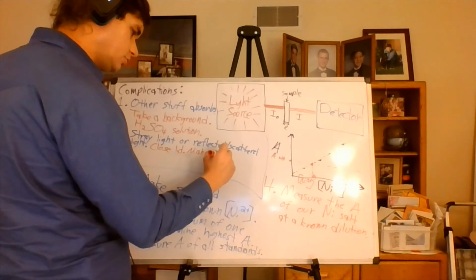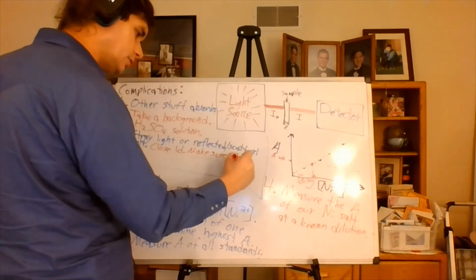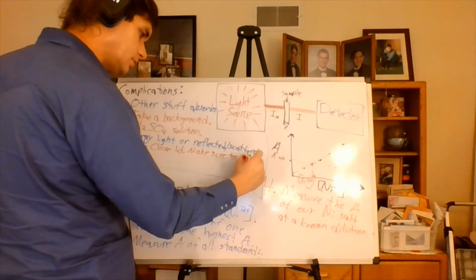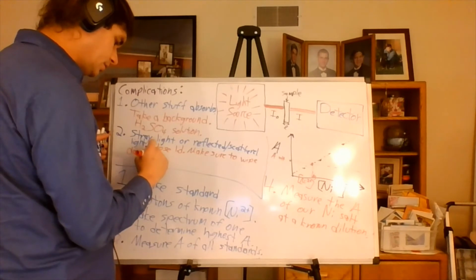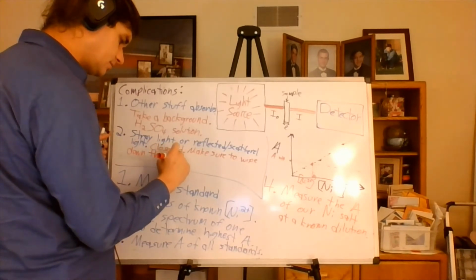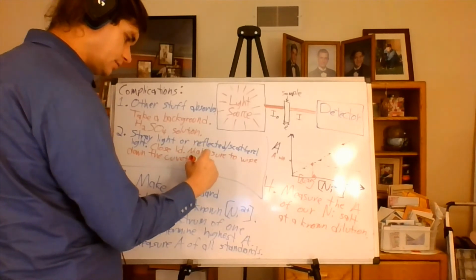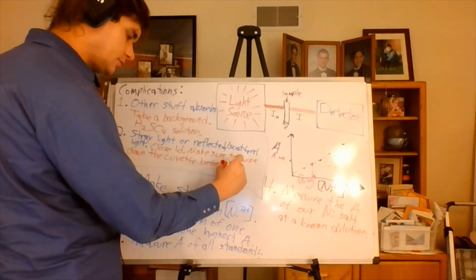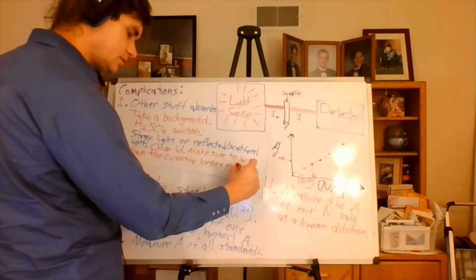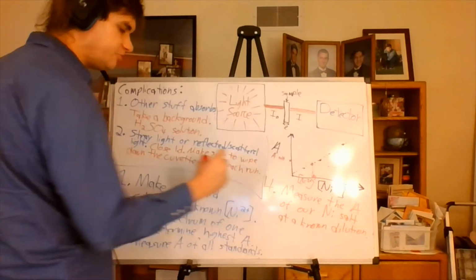What we do is we make sure to wipe down the cuvette before each run. So before each measurement.